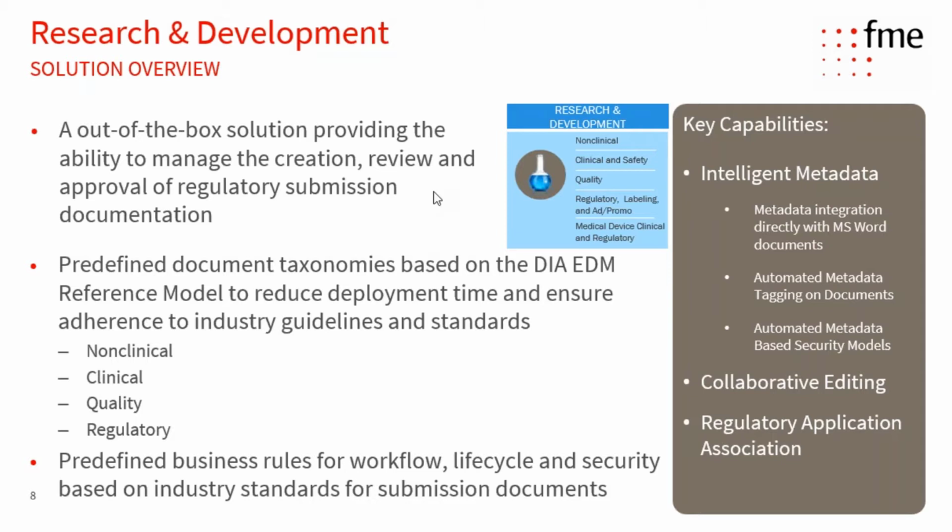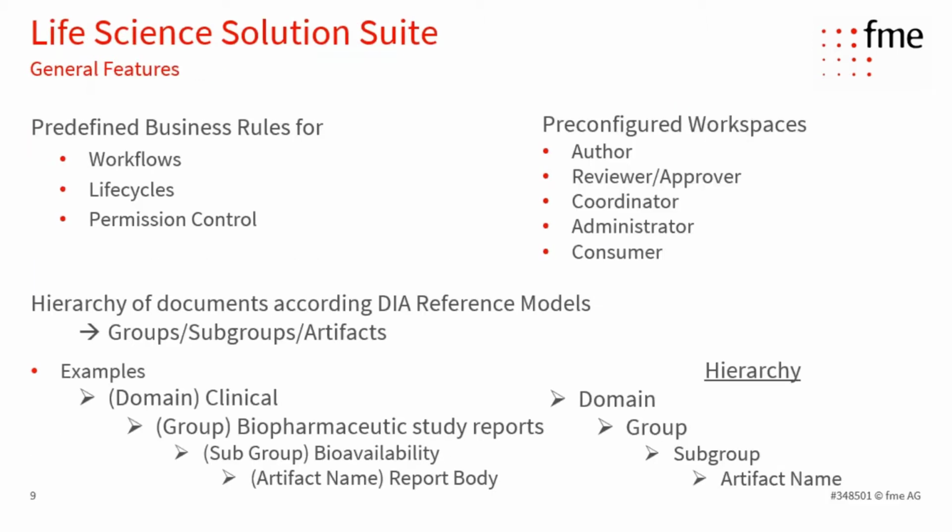We're going to walk through the document creation, review, and approval process, and things of that nature, including touching on master data in terms of products. You'll see this through the demo, but we're going to touch on the data model with the registration forms and walk you through how that information is managed within the life sciences suite, or the R&D module. Here's a depiction of the general features of the solution.